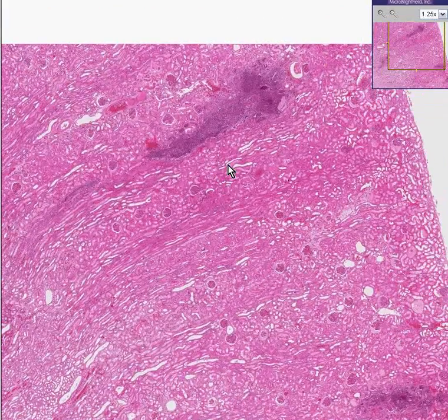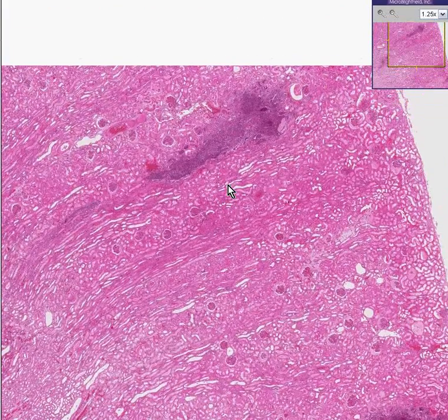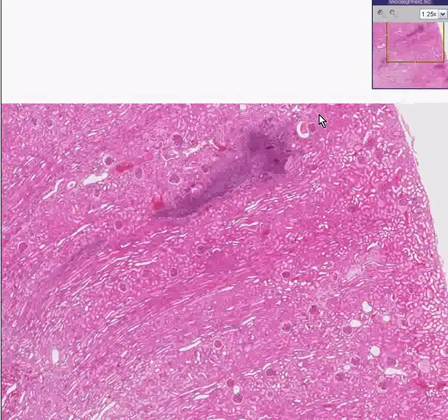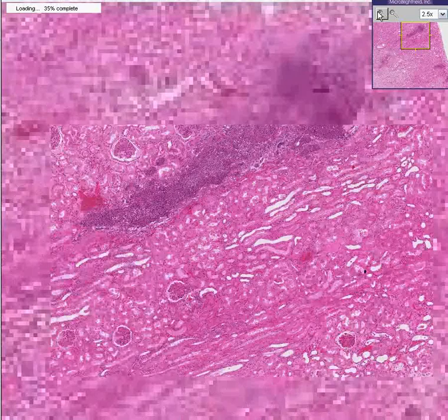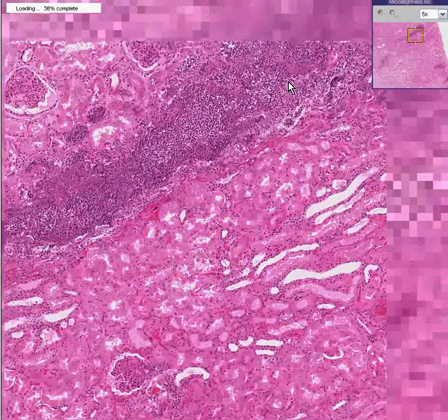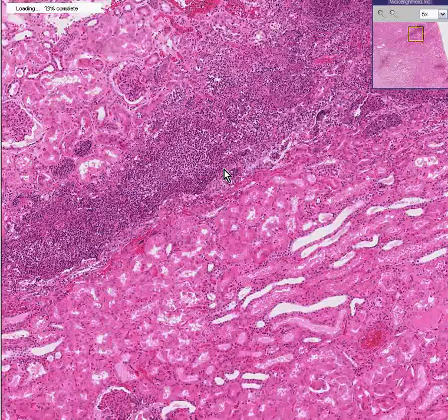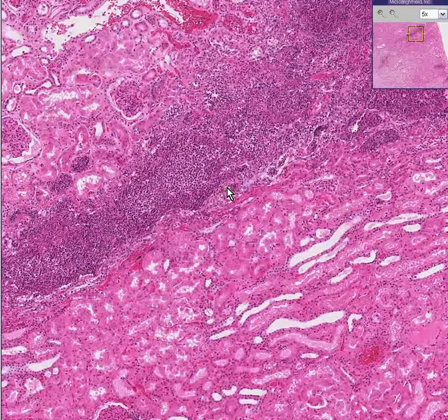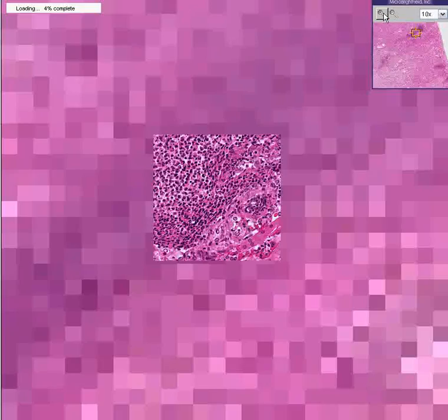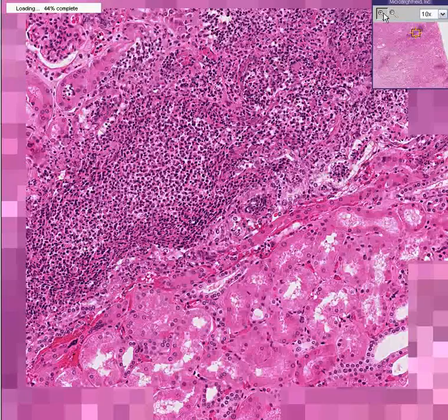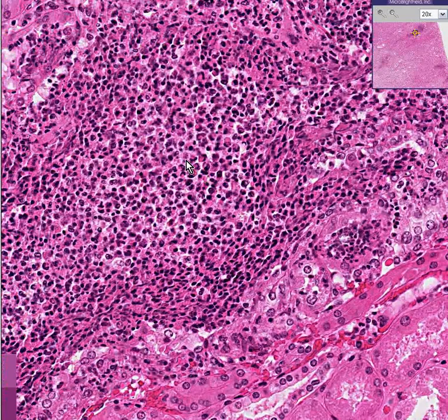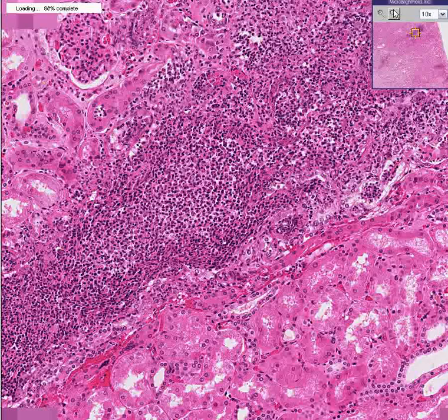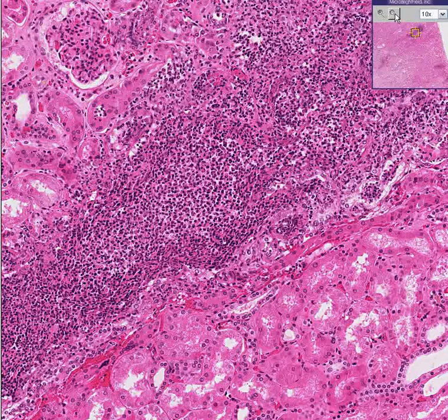So let's go to any one of them. What are they? Well, they look really blue. Not only do they look really blue, but there's a lot of cells, and that's why they look really blue. And let's take a close look at the cells. Guess what? They're all neutrophils. So that's a little micro abscess, isn't it?